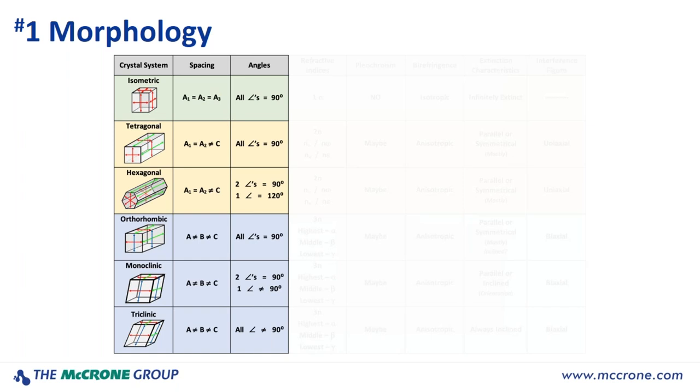Morphology. Understanding the morphology of a particle provides insight into other properties and can be used to narrow down or confirm possible choices. On this slide, I'm actually showing you a table we use, and I've got the crystal system listed here, the six crystals we are most often interested in, and I've got some information about these crystals, which allows me to collect information and data, which is very useful.